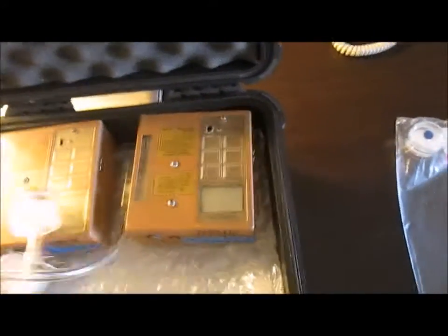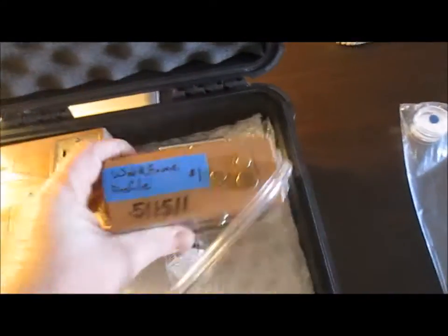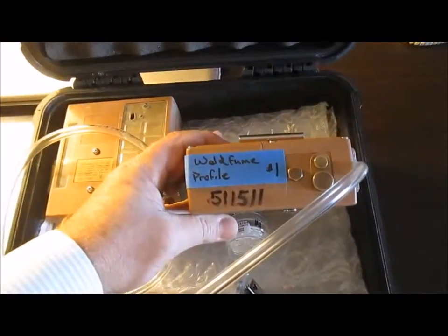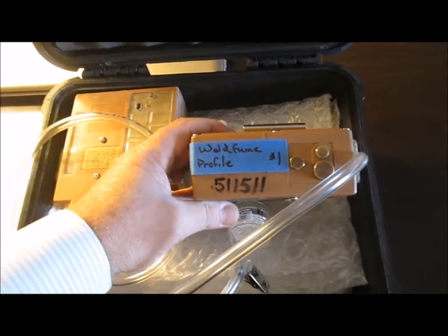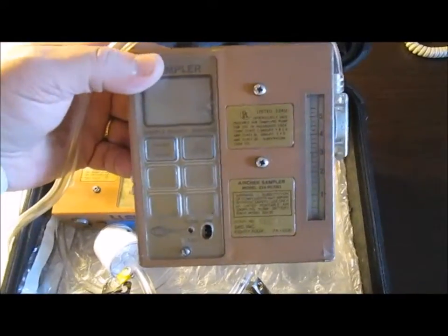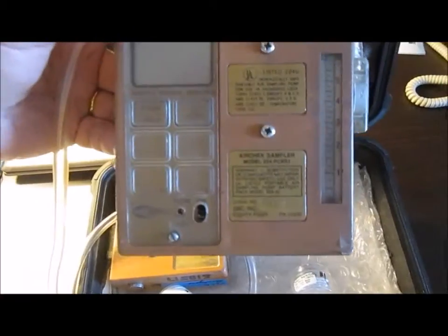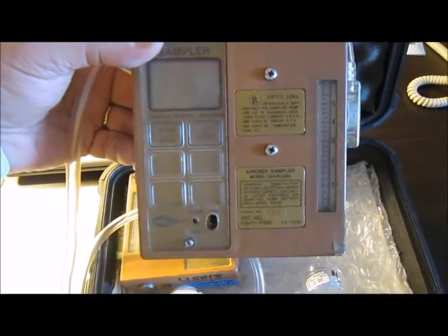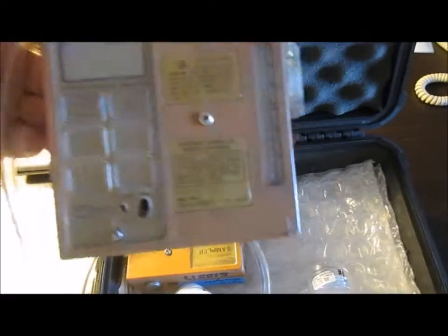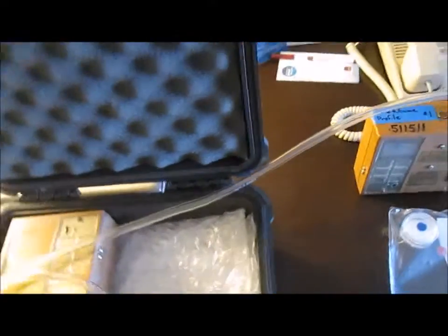These are SKC pumps and they are all marked with what they're going to do by the laboratory. This one has got the blue tape on it that says welding fume profile and it's test number one along with the serial number of the actual SKC pump. The pump is set and metered at certain liters per minute — they calibrate it before they give it to me, and then right after they're done they recalibrate it to ensure the pump is running at the optimum amount of air to be sucked through the cartridge.